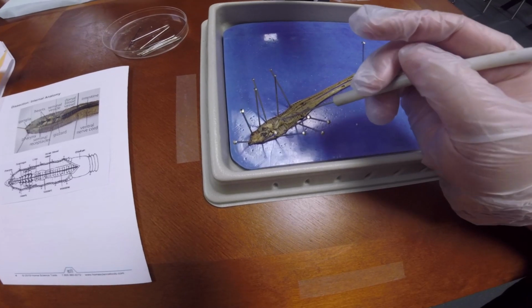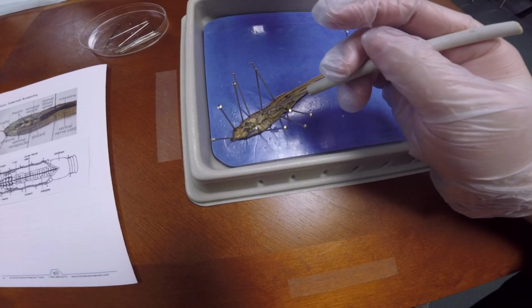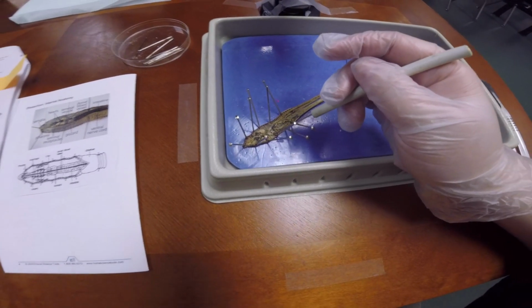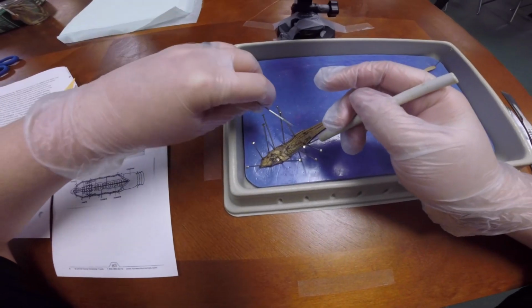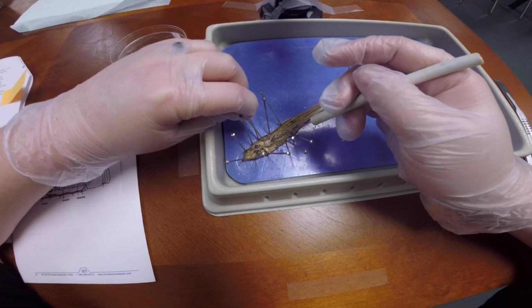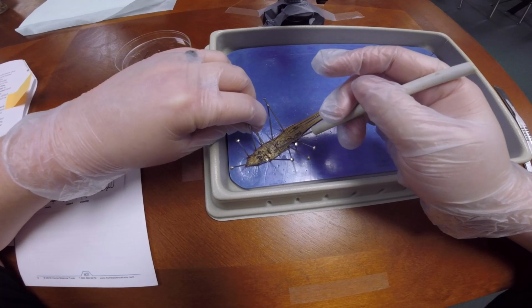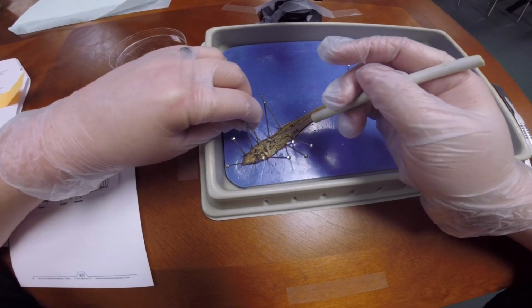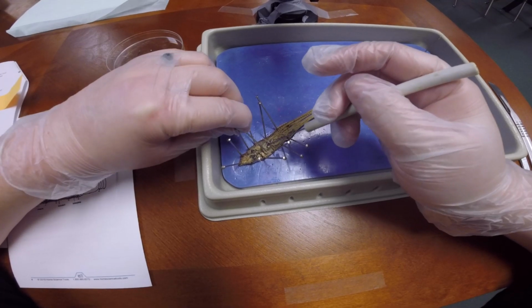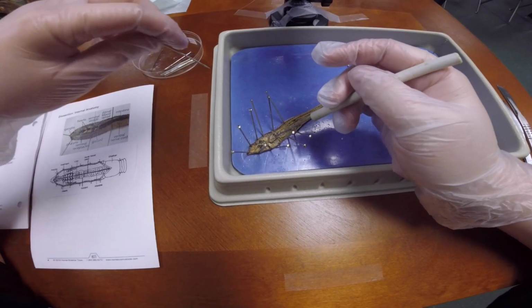Underneath the crop, you have the gizzard, which is this guy right here, thicker kind of looking, and then when you open that up, you can see the parts of soil and whatever this guy was eating before we got him. So you can kind of look at that, use your little poker. So it looks like he was eating some little parts here, and so that's going to be your crop and your gizzard.